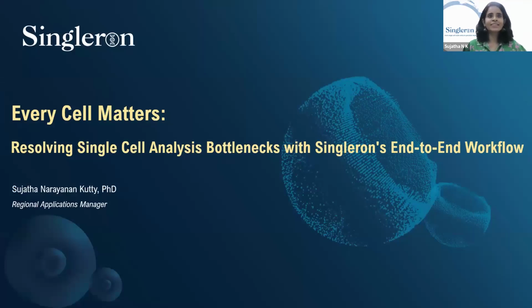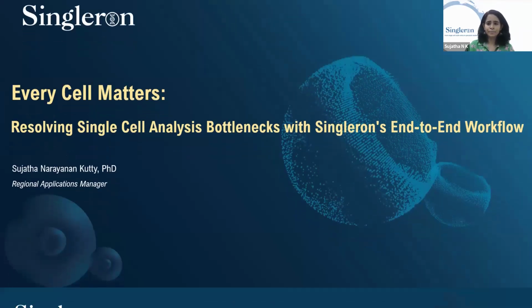So let's get started. For the next 20 minutes or so, I will explain what single cell analysis is all about, what requirements you need to keep in mind when you're embarking on such a project, what bottlenecks you could face, and how Singleron's end-to-end workflow can help you with this.